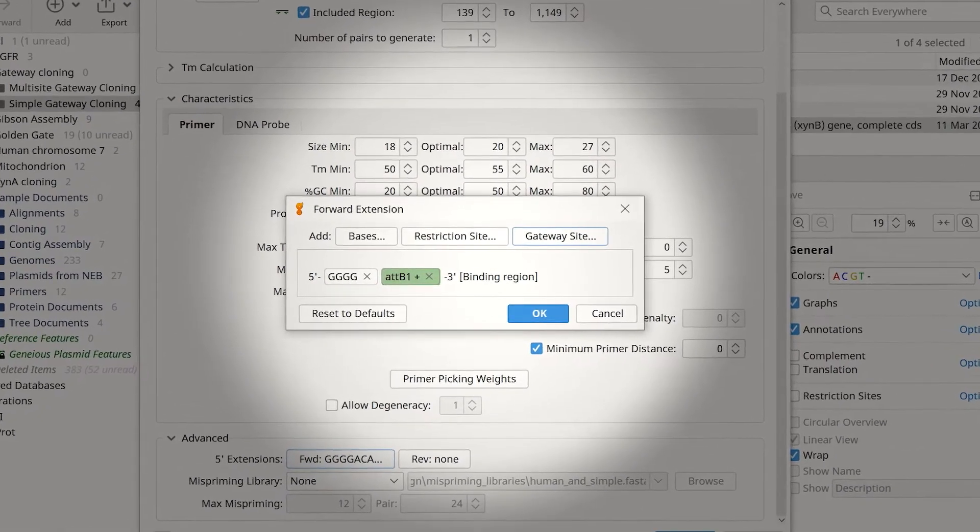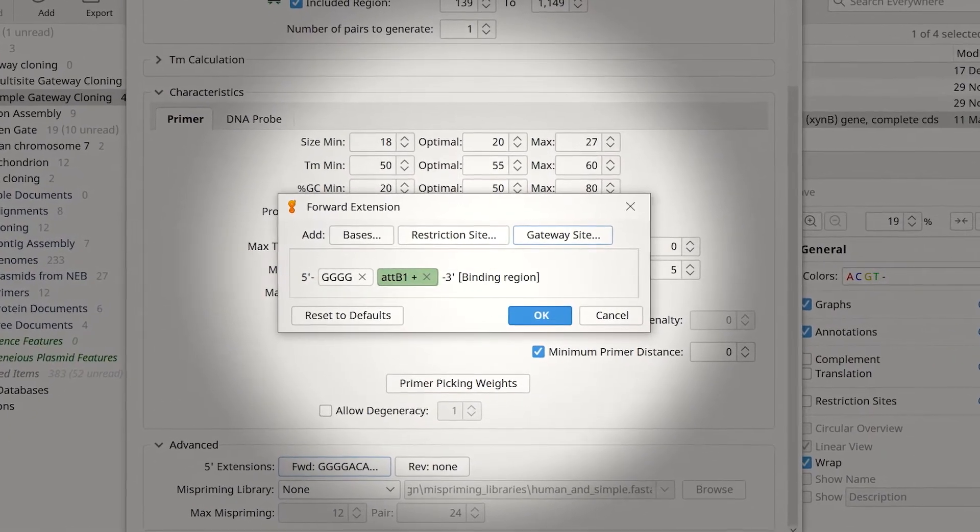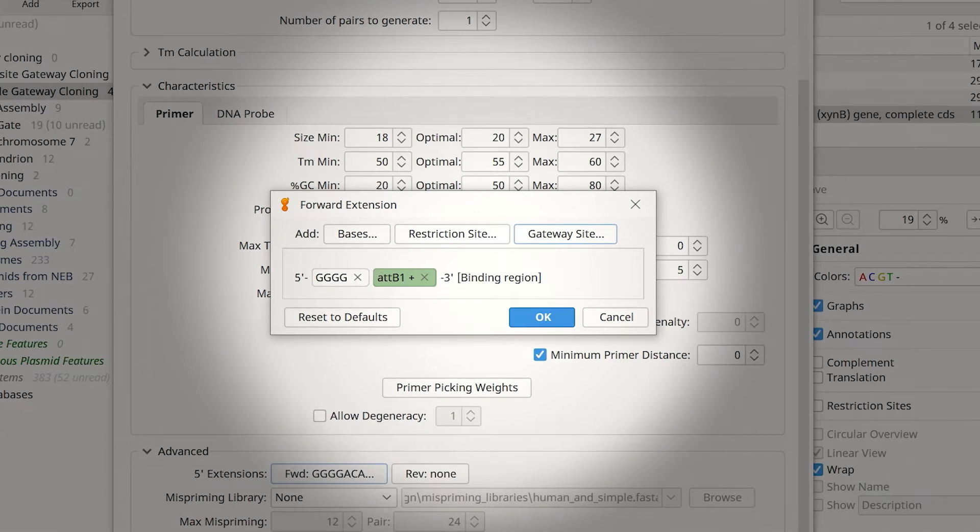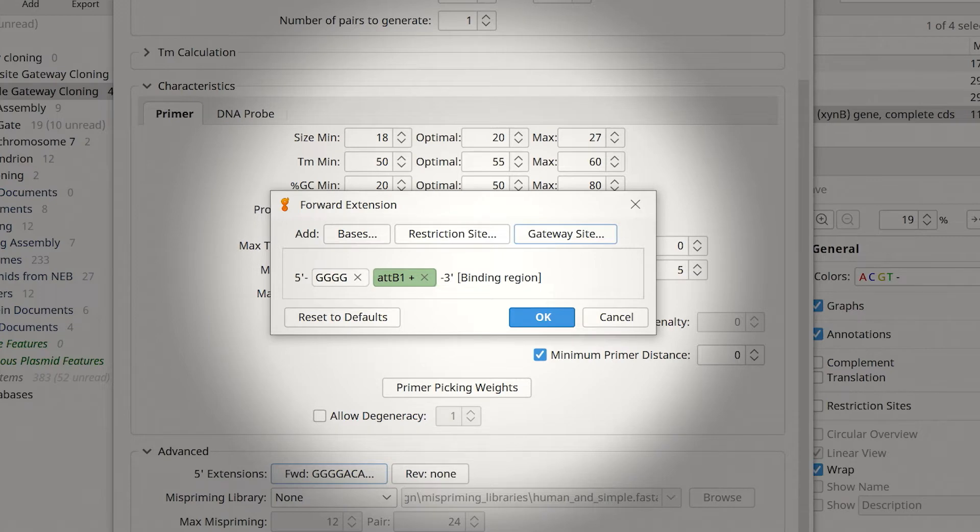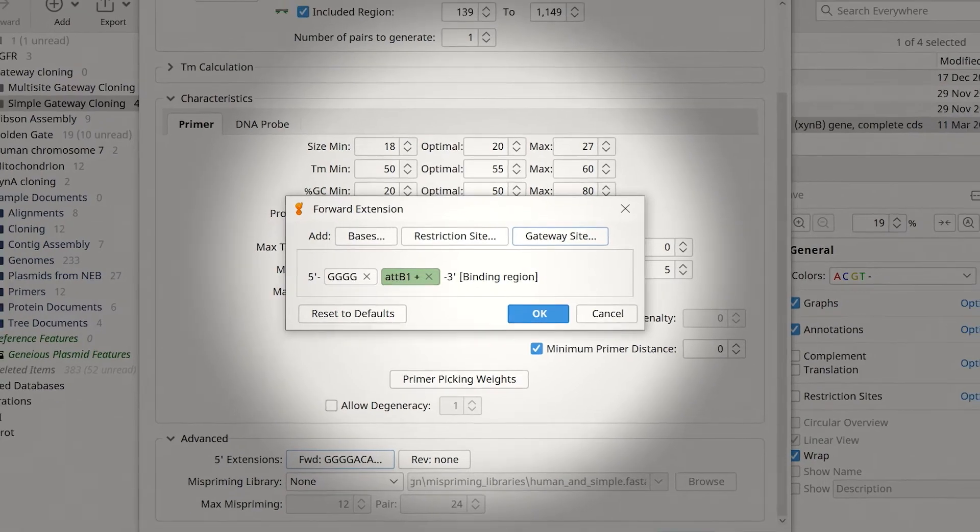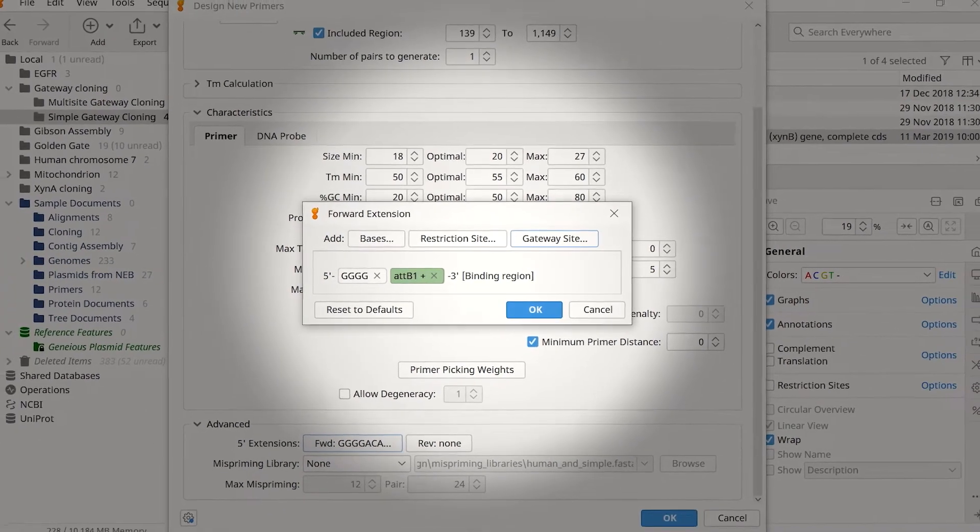The preview window shows four guanine nucleotides will be added at the five prime end, followed by the attB1 site. The added guanine nucleotides ensure the clonase enzyme can efficiently bind to the terminal attB1 site during cloning.